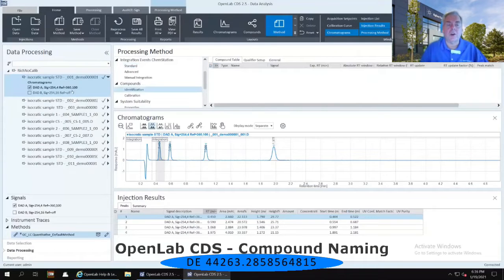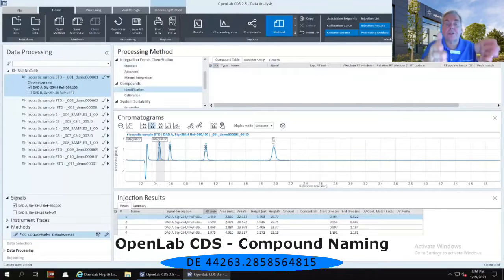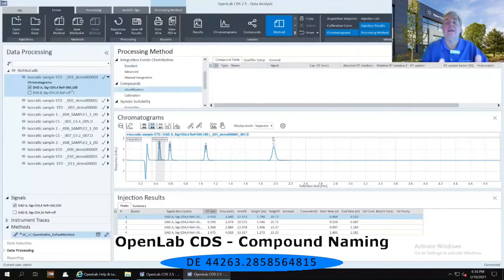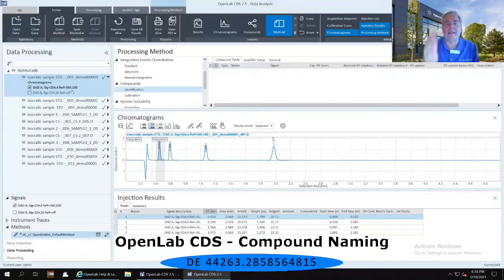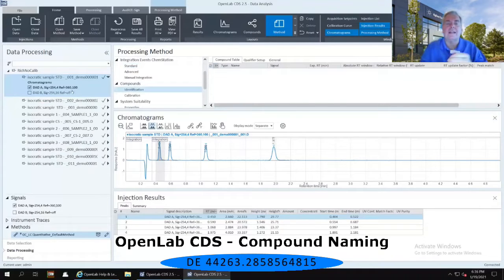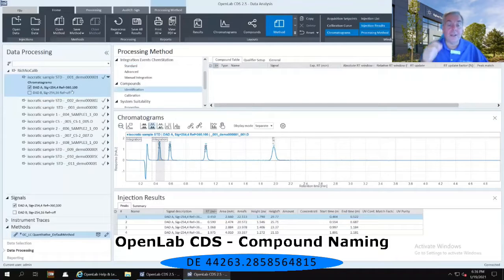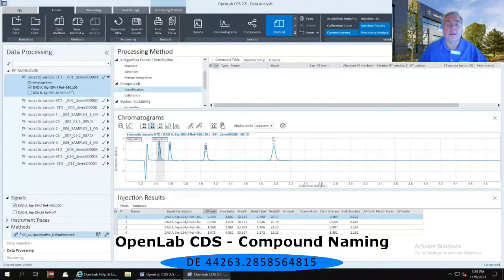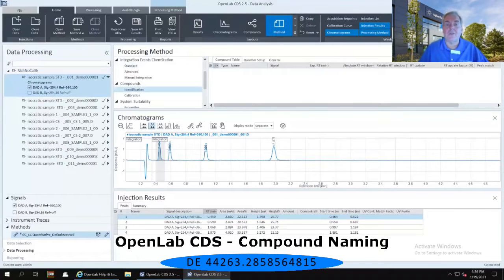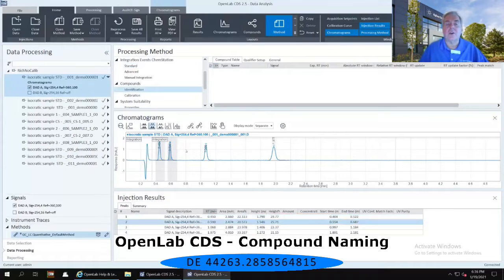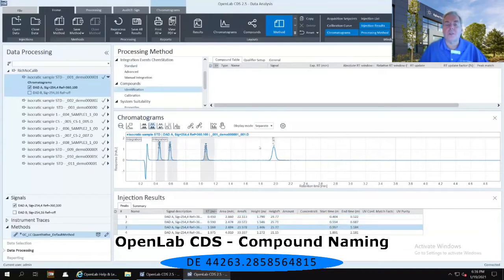It's grayed and the window has a gray column in it. I'm going to click the control button on my keyboard and select in the chromatographic view, in the chromatograms window, the second peak, the third peak, and the fourth peak.